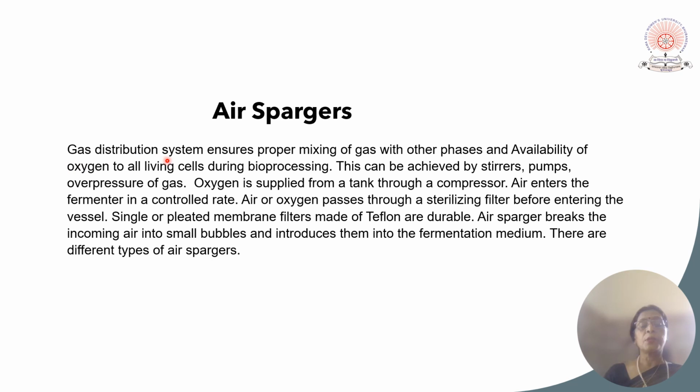Gas distribution is very important for the proper mixing of the gas. There are different types of devices like stirrers, pumps, or overpressure of the gas. For the maintenance of the aerobic living cells, oxygen is important. And oxygen, before entering into the unit of the fermenter, is sterilized.